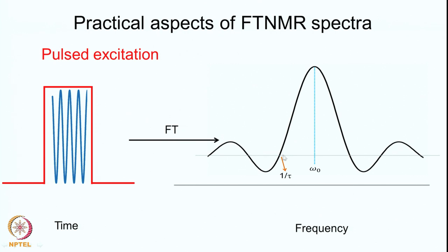So this covers a whole range of megahertz, but all of these will have different amplitudes and therefore different powers. However, we do not want that sort of a thing. We need uniform excitation over the spectral range. Suppose your spectral range is only a small region of some 10 kilohertz or something like that, which will be just a region around this.